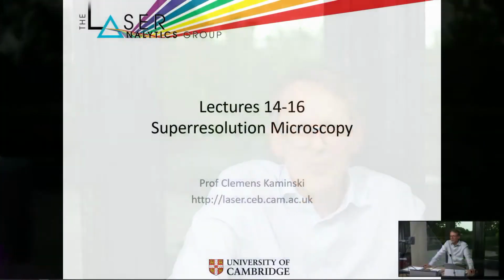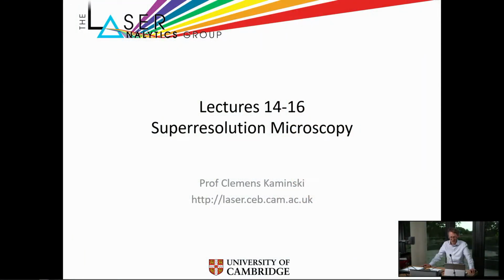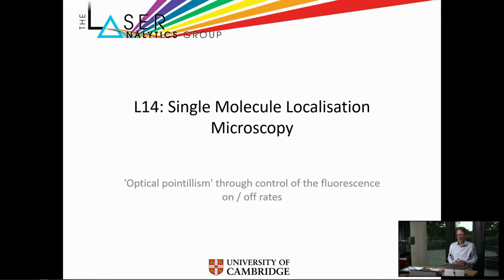And for that technique, Stefan Hell in Germany got a third of the prize. And so what I do now is I will switch over to the lecture notes on my screen, and I will begin by talking about this first method that's called single molecule localization microscopy.